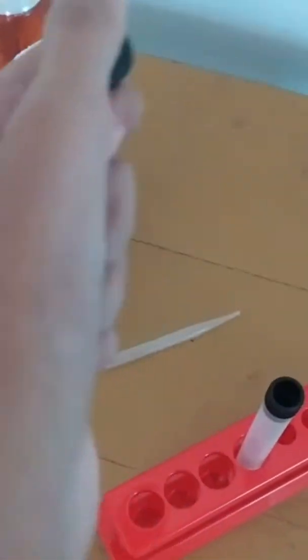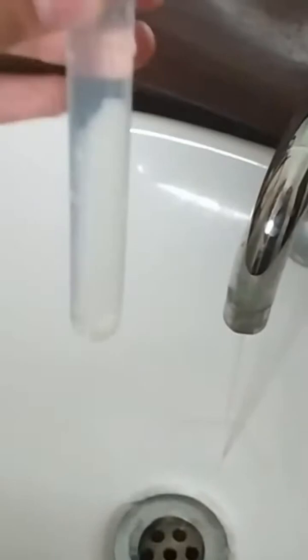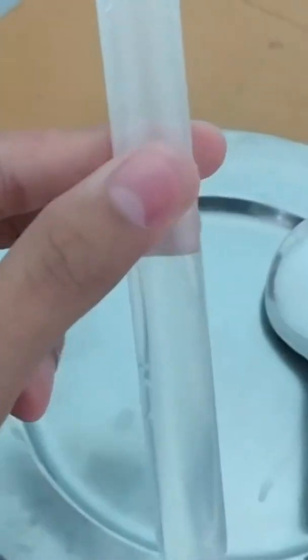First of all, we will take the test tube and pour some water inside it. Now we will add some salt inside it and dissolve it well. But make sure when you are adding salt, don't create a mess like this. Here we have dissolved the salt.